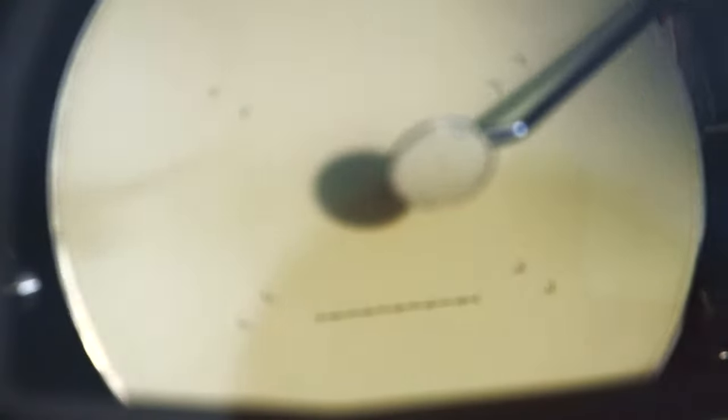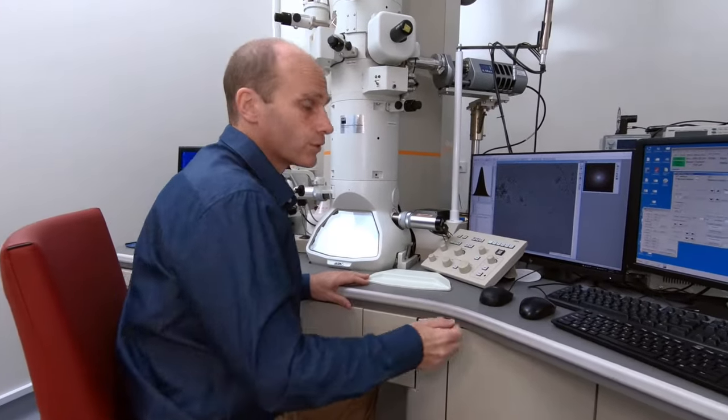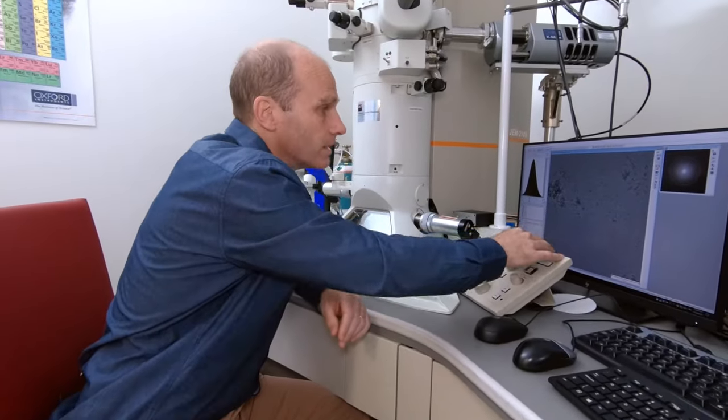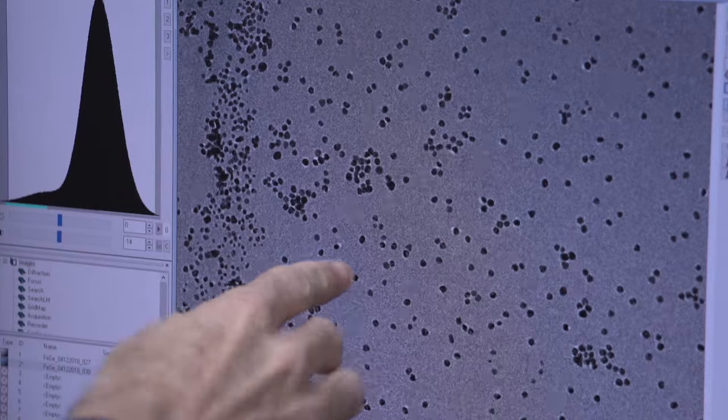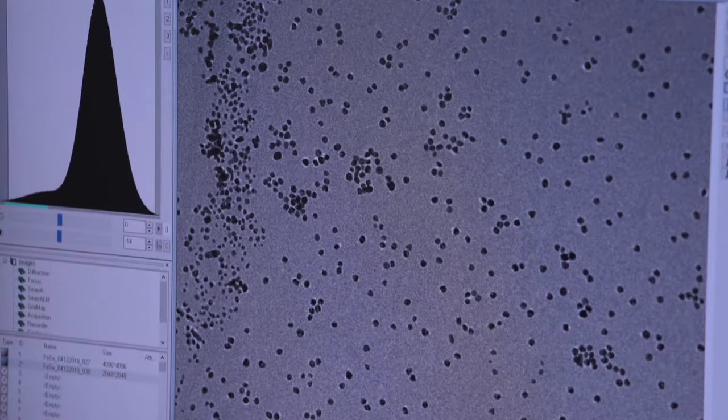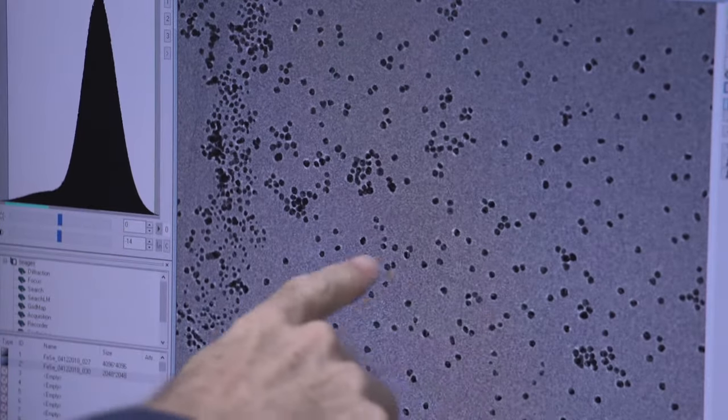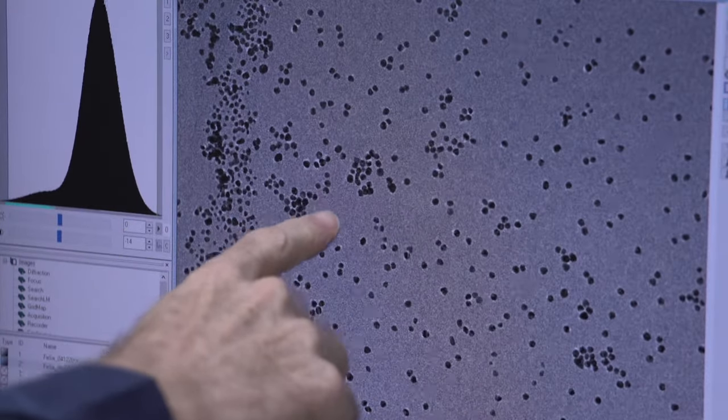So we've got our sample in the microscope and we have a beam of electrons. We can now see the image on the CCD camera. If you have a look over here, we've already started a live recording. And you can see these black dots on a sort of pale background. So these are the gold nanoparticles that have been synthesized. And the size of these is going to be very small. It will probably be on the order of 5 to 10 nanometers.